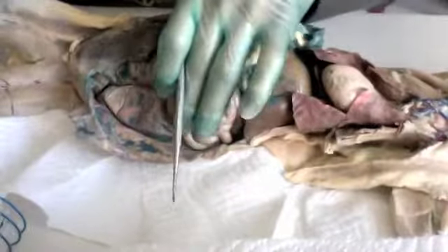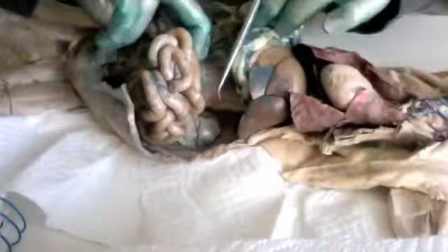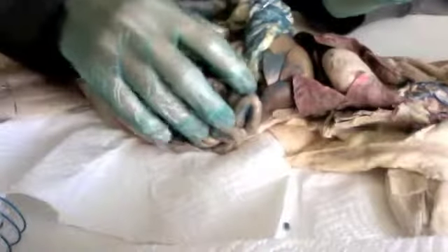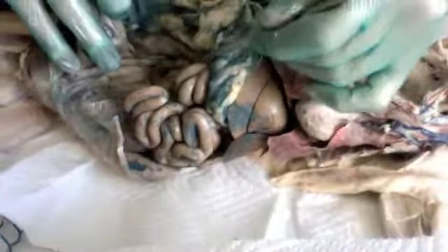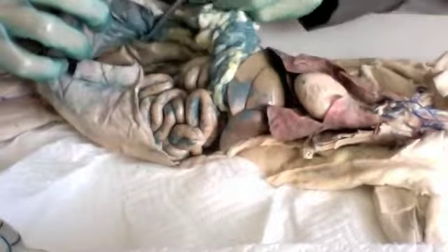And then the transverse colon, it's in the top back. Here. This is the transverse colon. That's where the flat part is. Then we have the descending colon. The descending colon is located here. And then we have the sigmoid colon, which is actually a little lower. So I'll make sure you can see it here. The sigmoid colon is here.